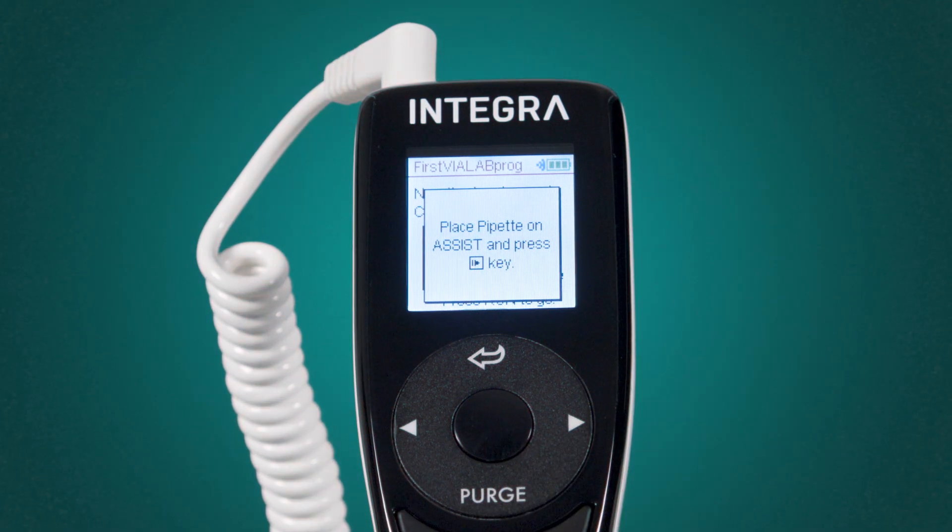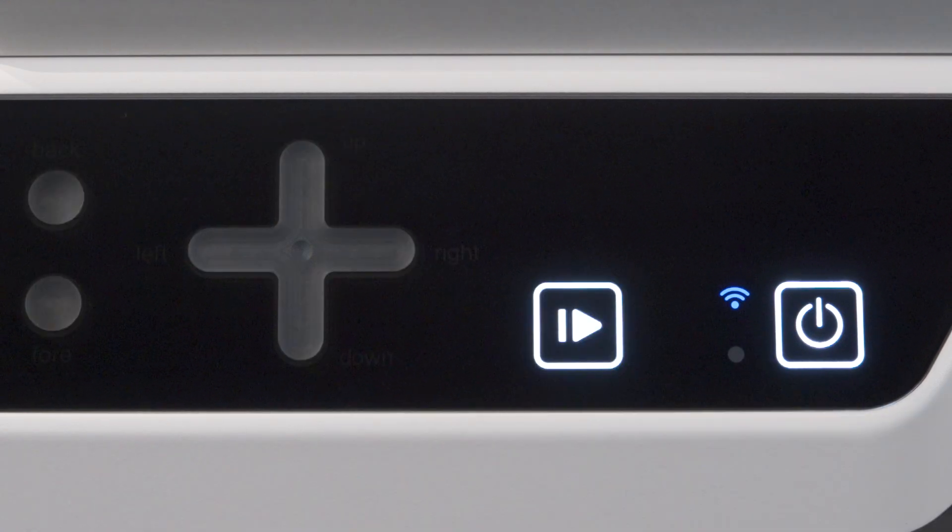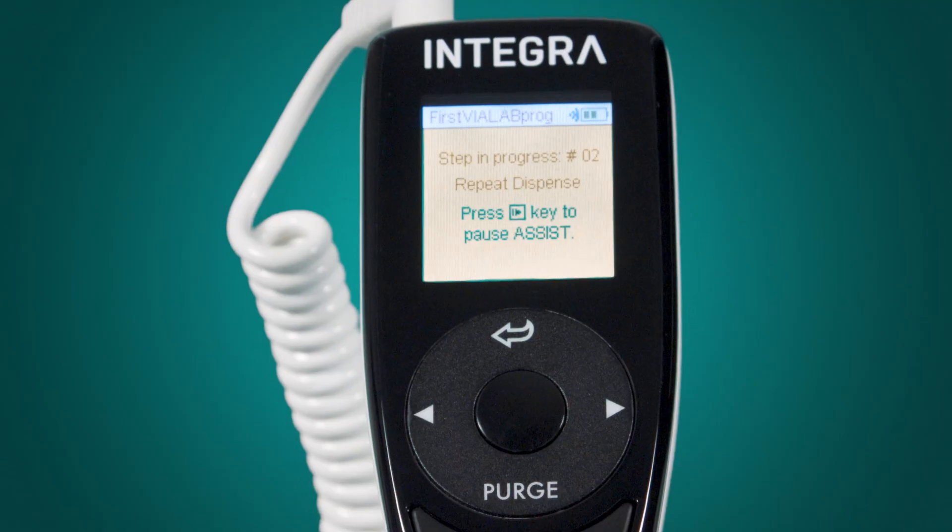After confirming the set tip status with run, the Assist Plus starts to process your automated workflow.